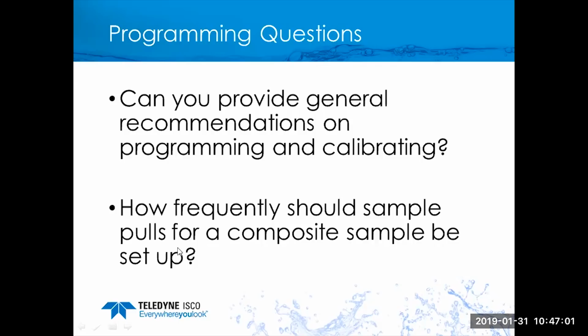That falls back into one of the answers I had given earlier about using your senses to discern that, hey, there's something going on here and I need to investigate it. In this case, getting a significant deviation on volume delivery would be one of those cases where you want to take a look at everything. And don't rule anything out until you've actually physically ruled it out as not being an issue.